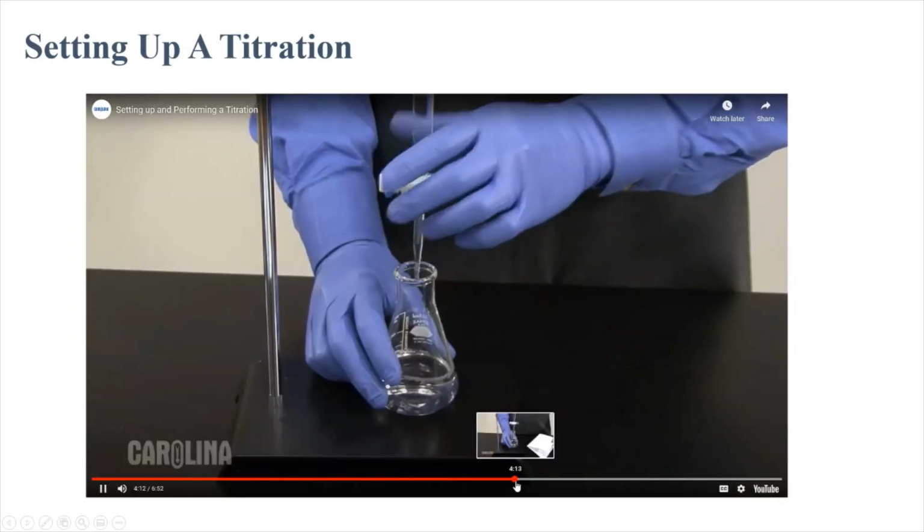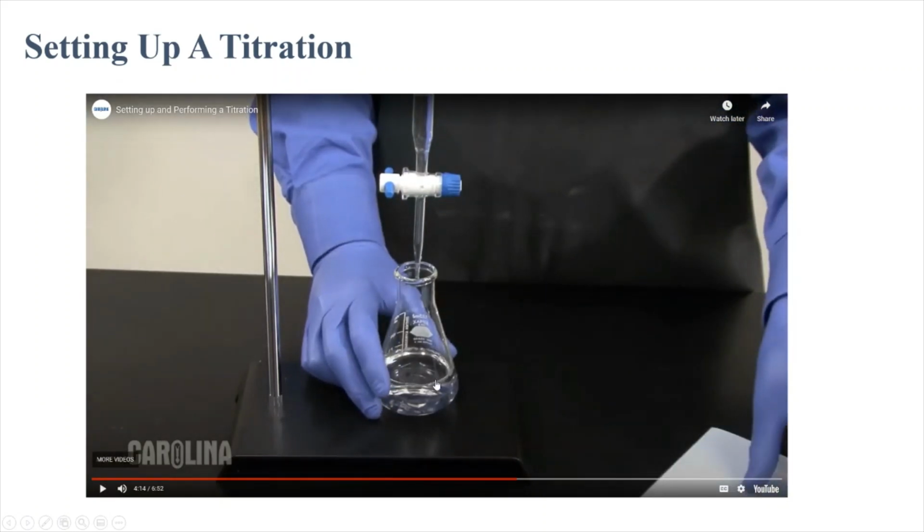Volume. Placing a piece of white paper under the... So what they're doing is in the very first titration that you do. In our lab, we're going to do 4 titrations. The first titration is going to be one where you do it quick, and the goal is just to get an approximate value for the amount of titrant that you need, right?